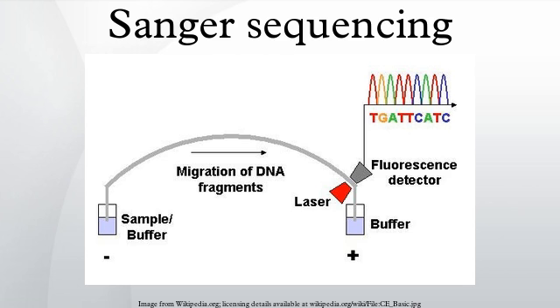The main obstacle to sequencing DNA fragments above this size limit is insufficient power of separation for resolving large DNA fragments that differ in length by only one nucleotide.